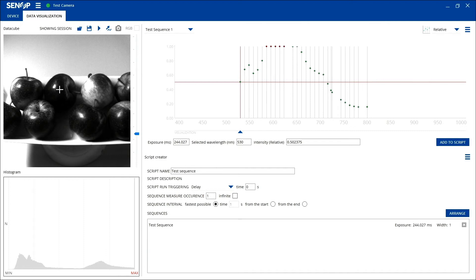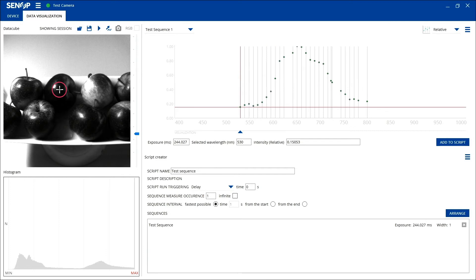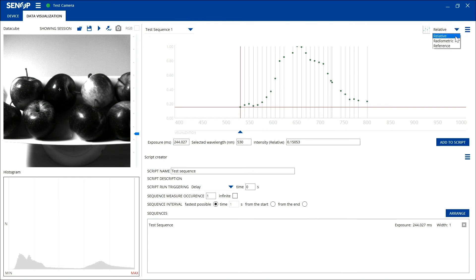The spectrum can be acquired by clicking the image at the desired location on the image. The spectrum will be shown at the Visualization window. The Y axis of the spectrum can be either Relative, Radiometric, or Reference. This selection can be made from the drop-down menu.